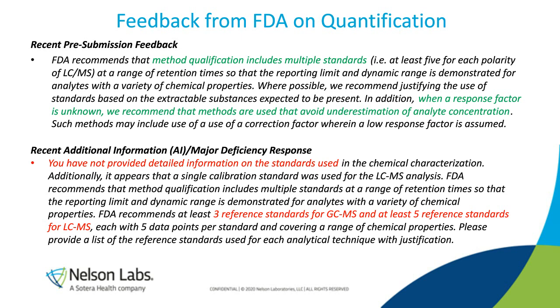You can see it's pretty much the same thing in the major deficiency feedback on the bottom half. They say you have not provided detailed information on the standards used. And so on the top one, it was talking just about LCMS, but down here it says we recommend at least 3 reference standards for GCMS and then 5 reference standards for LCMS, each with 5 data points per standard and covering a range of chemical properties.